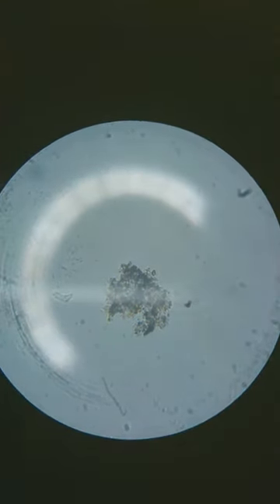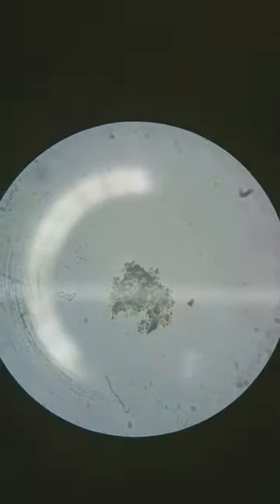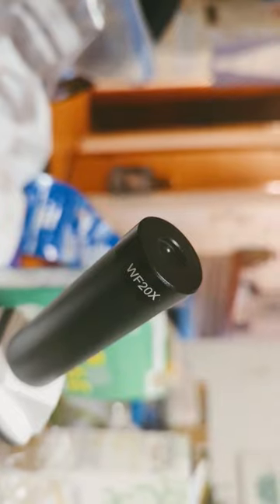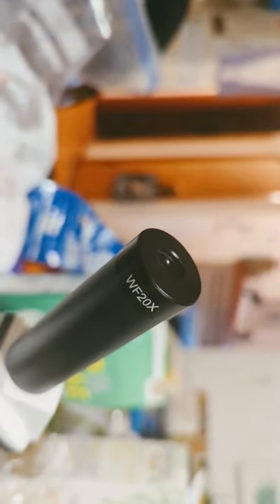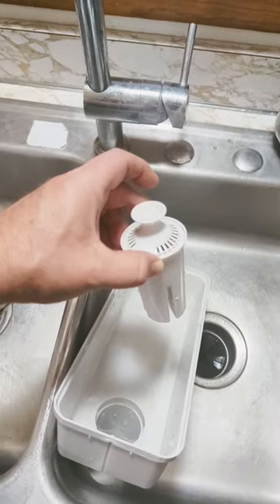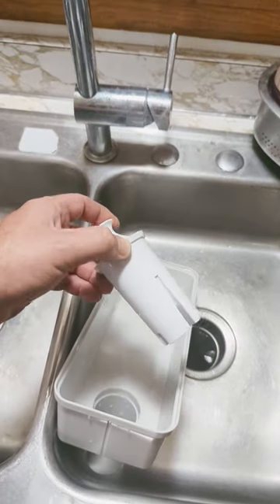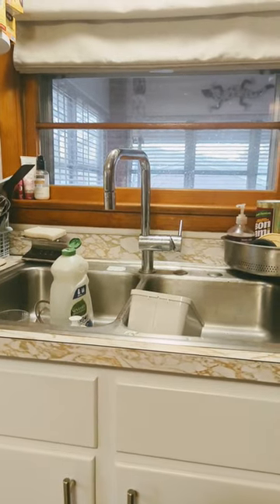I am NOT seeing any movement. I've been looking for quite a while — it's just not a thriving ecosystem if they're going through the filter. I did have the 20x, so that means that was 800 times zoom. This filter is overdue for a change, so I'm just gonna change it out, clean everything up, and check it again in a month. I wonder what tap water looks like.